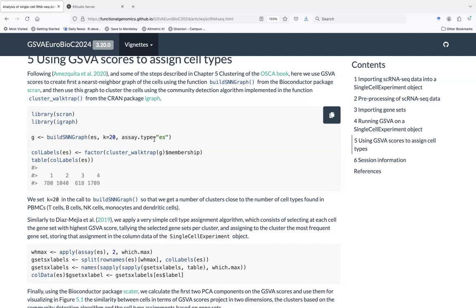You can do it in a parametric way. The package implements 4 different ways of doing this: one of our own algorithm, GSVA, PLAGE, which is the first principal component loadings, and the z-score method. But of course, then you have AUCell, I don't know. There is a plethora of algorithms for doing this. And yeah, I think you should try every one of them and decide what works better.